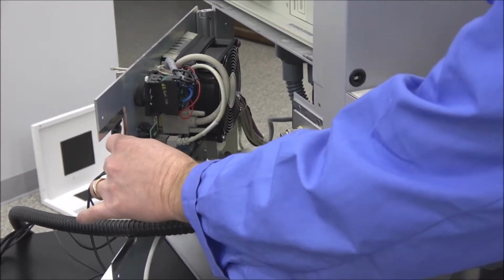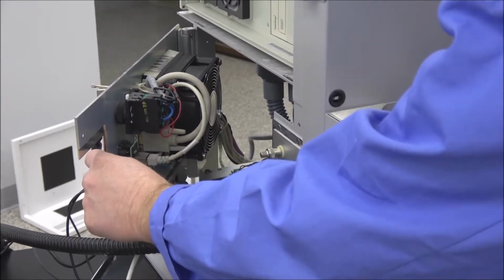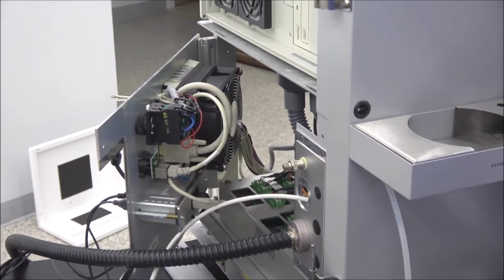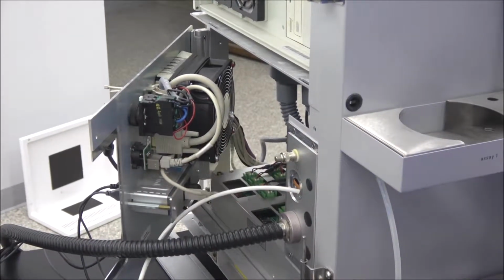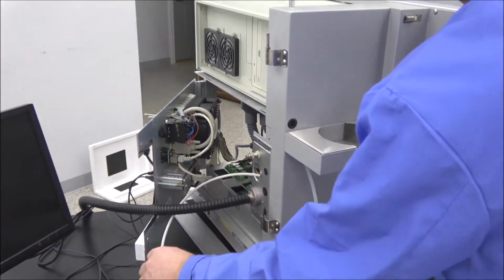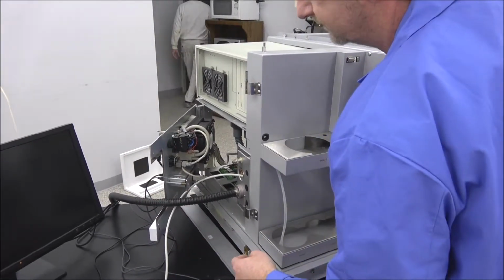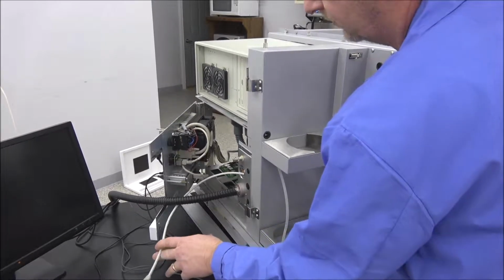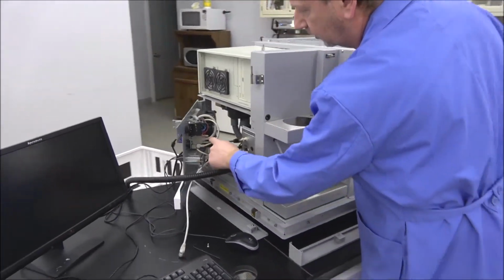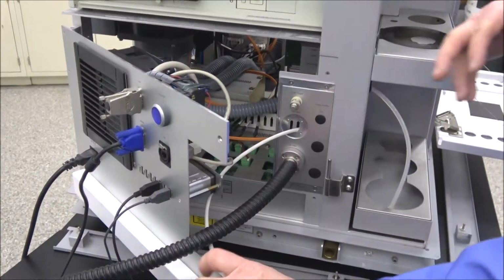If you need to gain access to the internet, which I probably recommend not to, because Windows 7 is no longer supported, and you want to avoid getting any viruses on the computer. So if you just want to network it, that's fine. You can use it for that, but I strongly recommend not hooking it to the internet. That's one reason I unhooked the networking cable here and plugged in the UV light source cable. So anyways, if you want to, you can just run it out like this one is. Run out this hole and hook your networking cable back up here. That's up to you, but I just thought I would point that out.